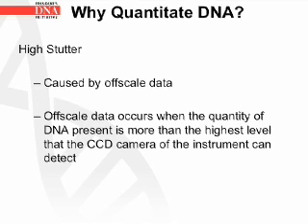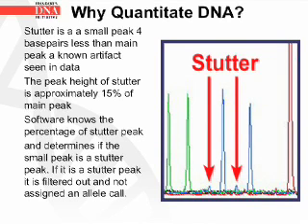High stutter is caused by off-scale data. Off-scale data occurs when the quantity of DNA present is more than the highest level that the CCD camera of the instrument can detect. First, let's go into what stutter is. Stutter is a small peak that is four base pairs less than the main peak. This is a known artifact, and it is seen in data.